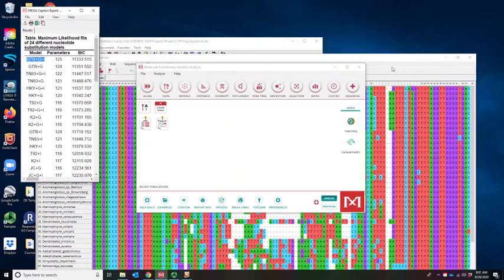So the next thing that I would like to do is actually do a phylogenetic analysis of this data set. Again, there are different programs that can do this, and some are a little bit more powerful than others, but a little bit more or less user-friendly. Mega has its drawbacks, but it's fairly user-friendly, and the nice thing is it's very flexible. So we can do just about everything we want to do for this class with this one single program, which is why I've chosen it.